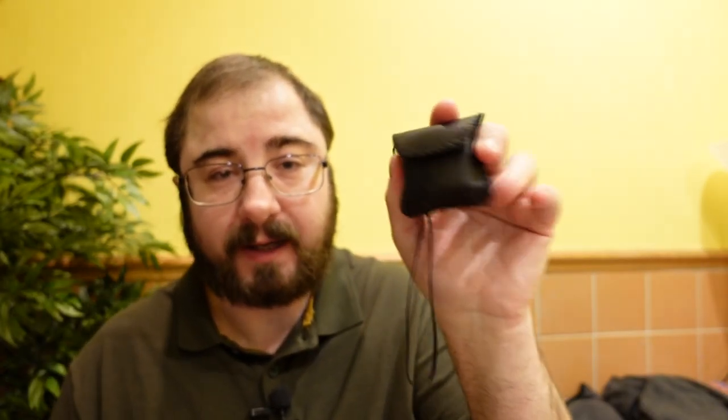Inside is very soft, there's a little bit of velcro for the fastenings, and it feels nice and soft on the outside too. So if you're into exploring small worlds, you could take that out with you — it wouldn't take up much room in your bag. We know how full our bags already are, and how much more stuff we can take out with us when we go out.